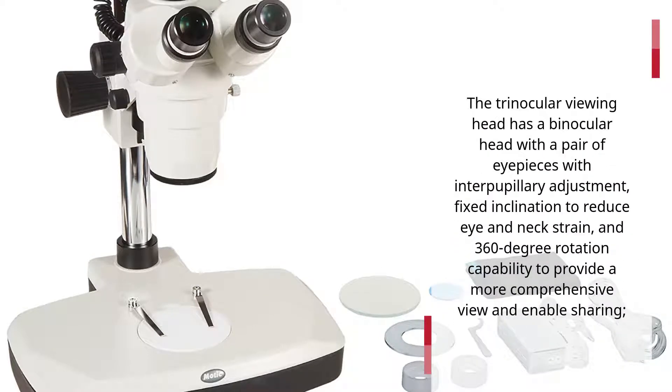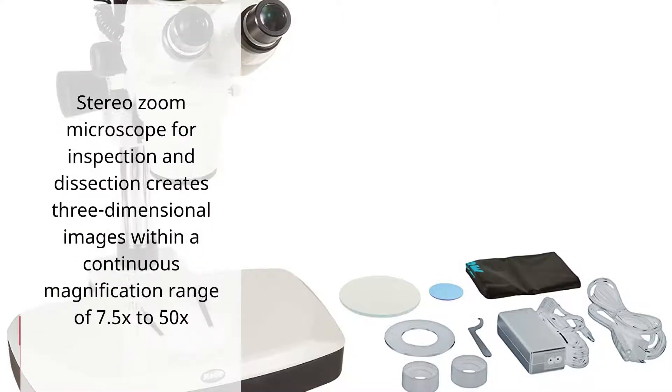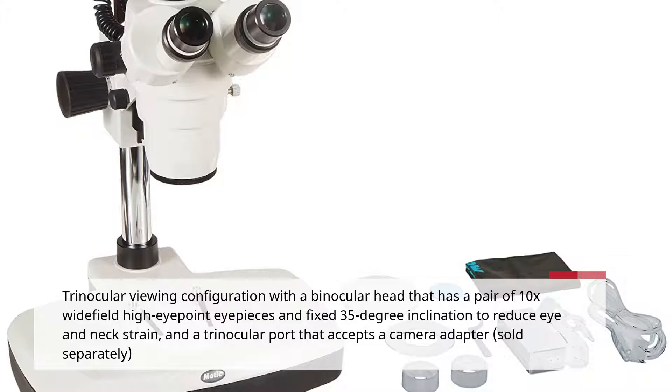The Trinocular Viewing Head has a binocular head with a pair of eyepieces with inner pupillary adjustment, fixed inclination to reduce eye and neck strain, and 360-degree rotation capability to provide a more comprehensive view and enable sharing. The Trinocular Port accepts a camera adapter, sold separately. High eyepoint eyepieces ease viewing for viewers wearing glasses.